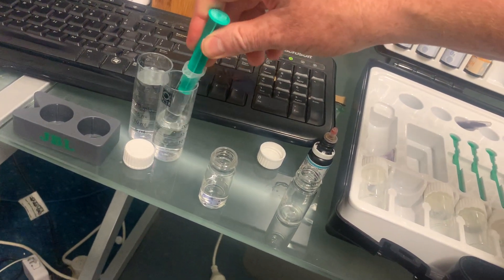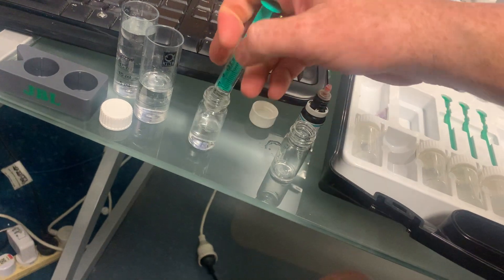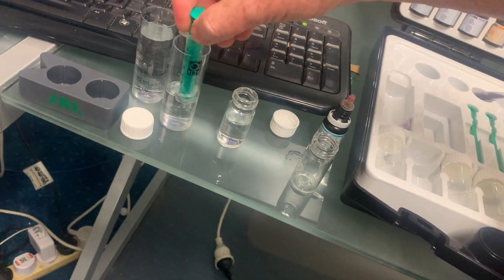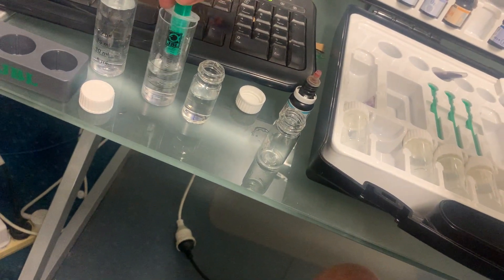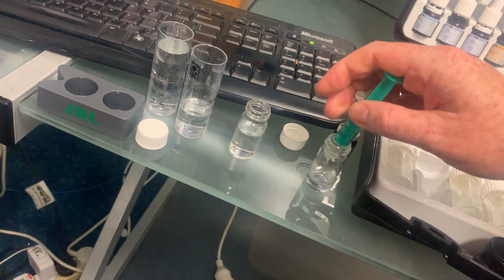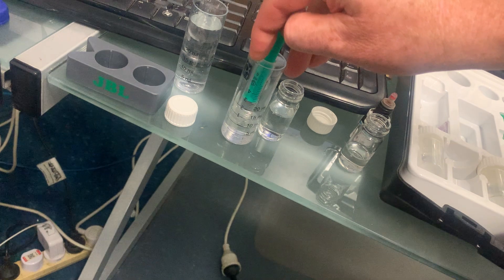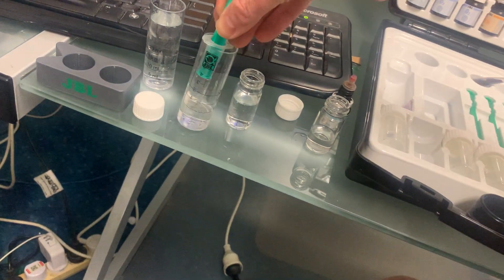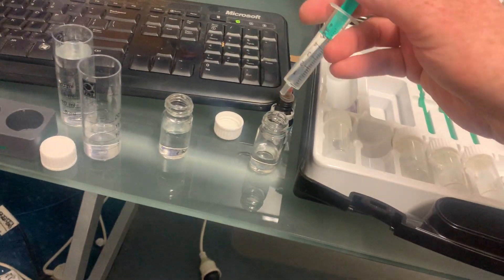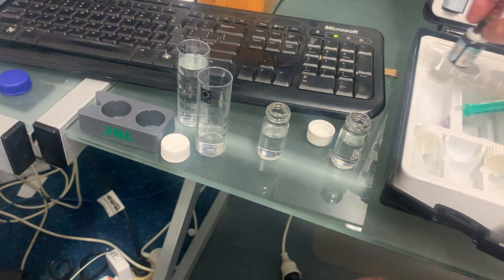First, I'm going to get five mils and add that to the five mils I already added from the tank. Then I'm going to get another five mils and another five mils, so we now have ten mils of water in both vials.